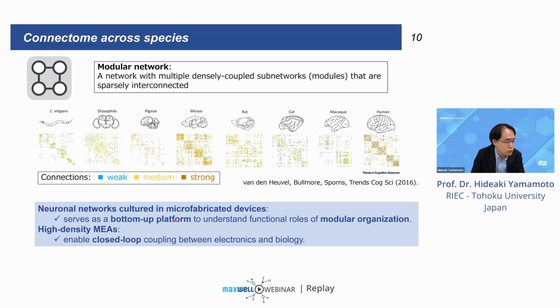And so in the remaining slides, I will go over some of our recent studies showing how neuronal networks cultured in microfabricated substrates serve as a bottom-up platform to understand functional roles of such modular organization, and show how high-density MEAs enable closed-loop coupling between electronics and biology.